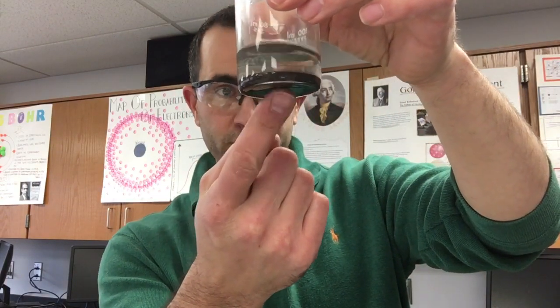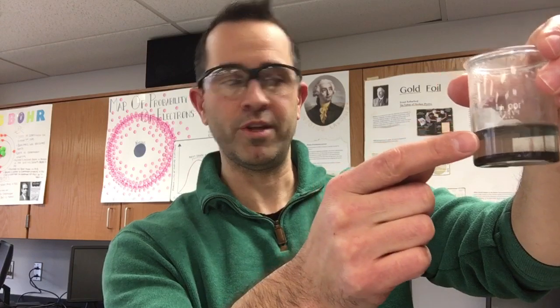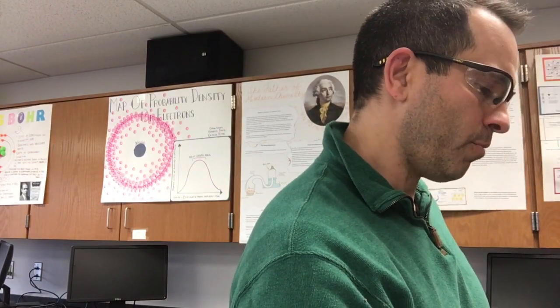Now look, this is what's left of what we put on the hot plate. This is our copper oxide — that's a precipitate — and so this is where all the copper's at. It's a brown, sort of muddy solid at the bottom. So we want to get this separate from this, and we're going to use a technique called decanting to help us.